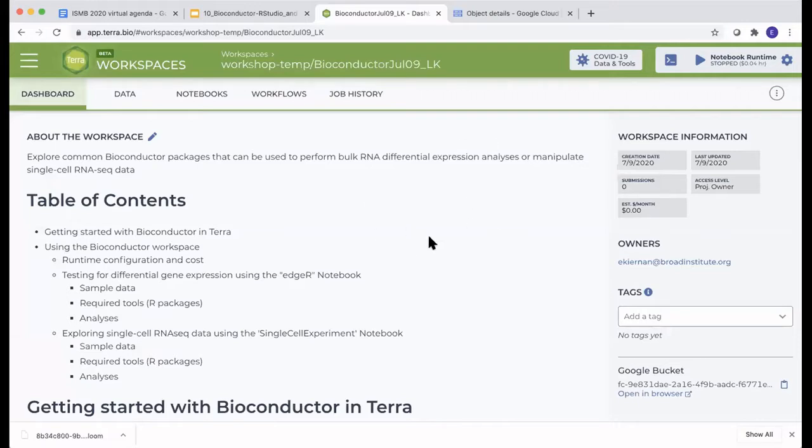And let me just pause here for a second. The very first thing we're going to want to do is get our notebook runtime set up. Are there any questions? I heard some chatter. Okay. So, a question, if we still have the previous notebook open, should we close it? Yeah, I would go ahead and close out of that window. And we're going to start fresh. We're going to actually delete your runtime and everything. So if your runtime is still going, we're going to actually delete that virtual machine right now and create a new one.